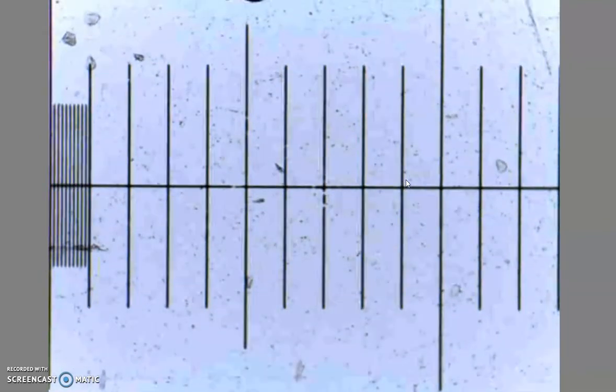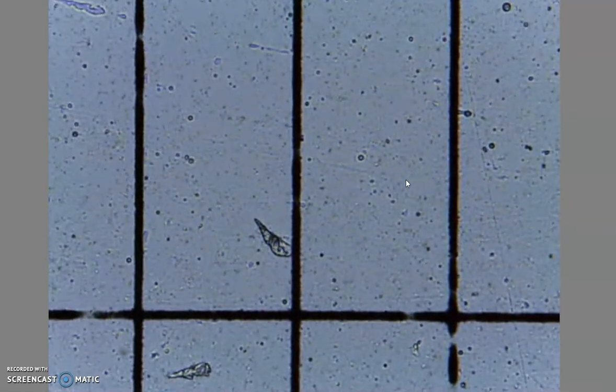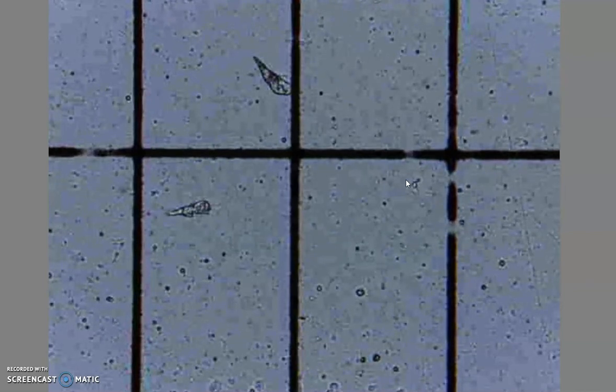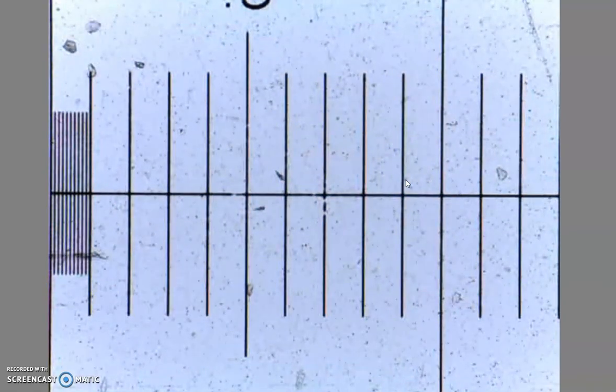The reason that we can't measure for 40x, so I'm going to zoom in again. I'm going to 40x, and this is what the ruler looks like under 40x. Even if I made this as clear as can be, measuring this accurately is basically impossible, right? It would be very challenging. So I'm just showing you this to show you why we aren't measuring our 40x. It is basically impossible to do. So you are going to be measuring at 10x, and then you are going to be using the equation to figure out what the other two are, because they will be related.